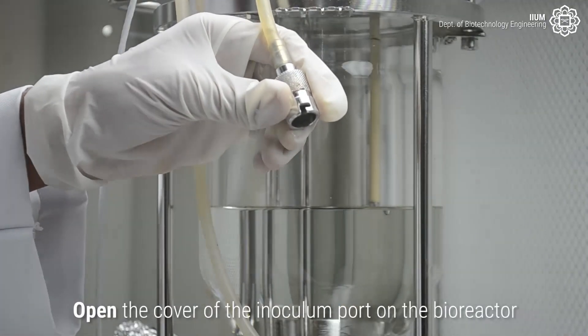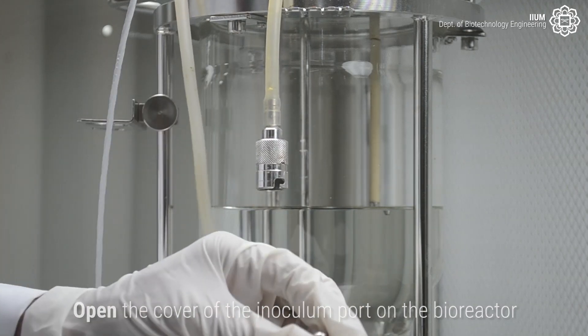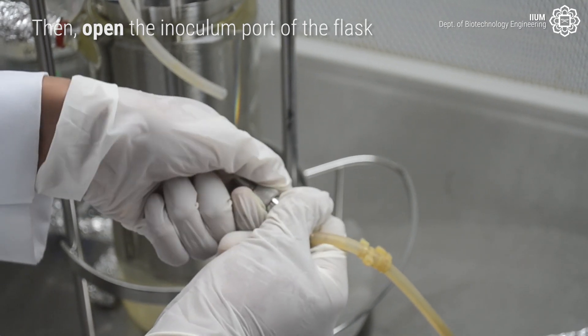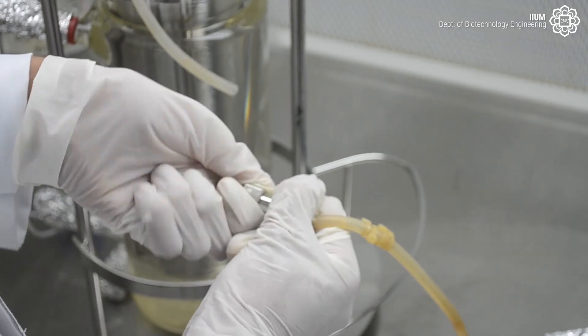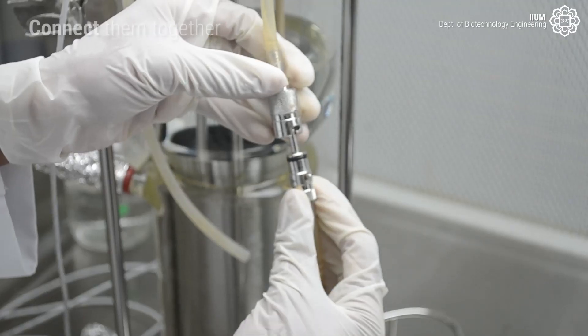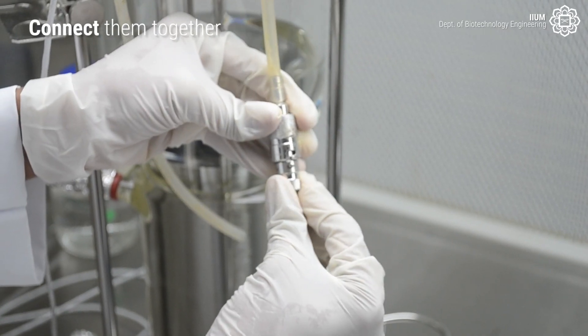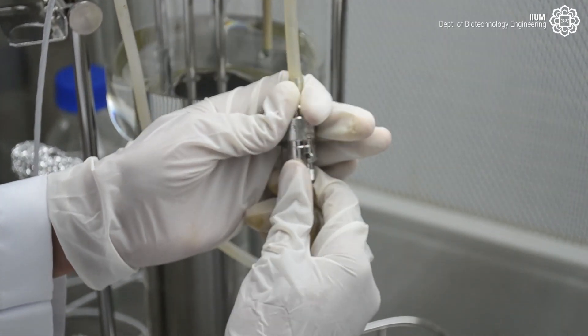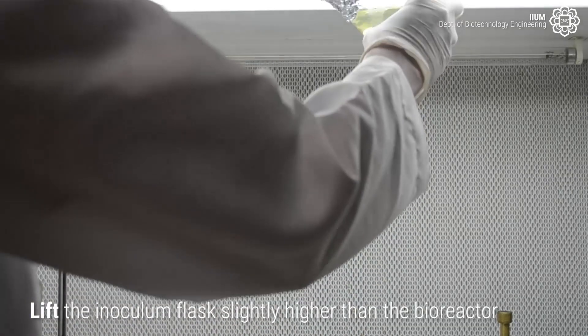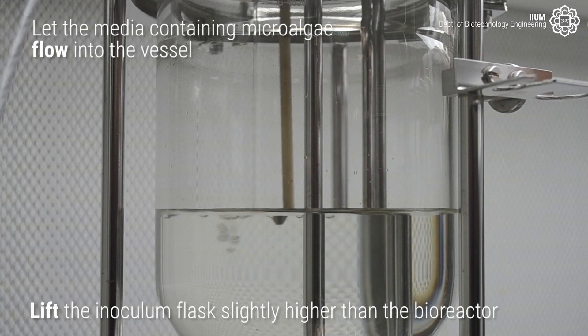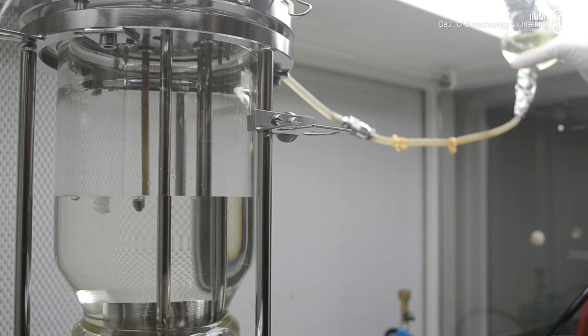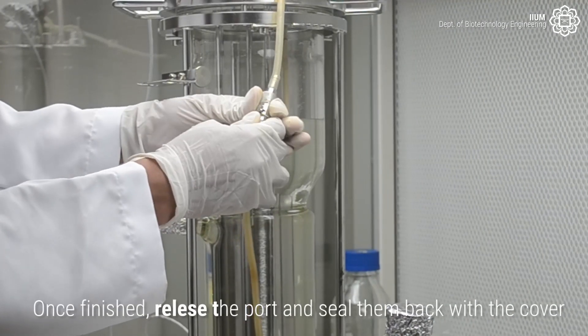Open the cover of the inoculum port on the bioreactor. Then open the port of the flask. Connect them together. Lift the inoculum flask slightly higher than the bioreactor. Let the media containing microalgae flow into the vessel. Once finished, release the port and seal them back with the cover.